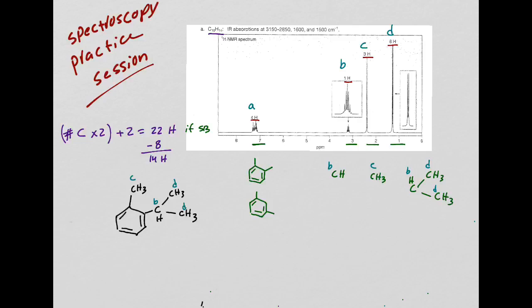Because it's around after 3 ppm, because it's directly attached to a benzene ring. So that's acceptable. I can buy that. Now, look at this splitting. At the beginning, I thought it was like a pentet, right? I go 1, 2, 3, 4, 5. But you can see the other ones are coming out over here too, right?